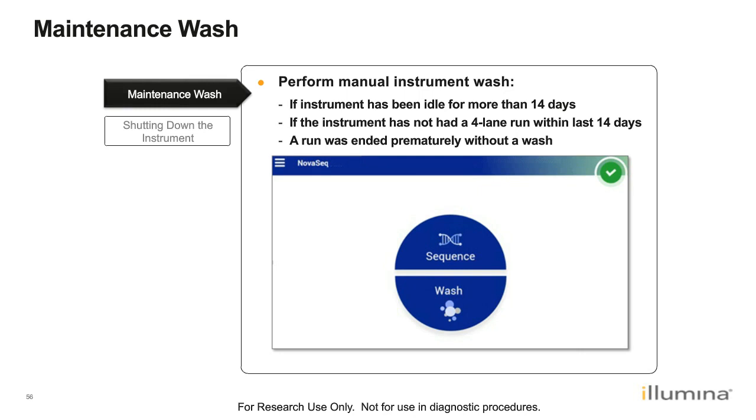So when performing a manual maintenance wash, please be aware that the system does need a used buffer cartridge. So we do recommend that labs save a couple of used buffer cartridges from your old runs, just in case we need to perform some extra maintenance washes.